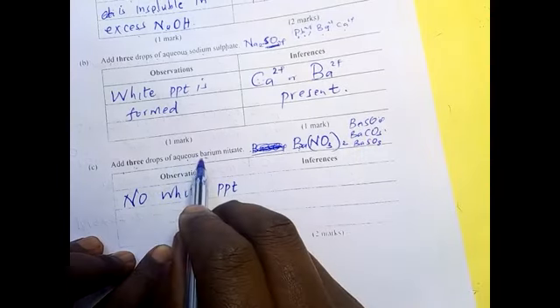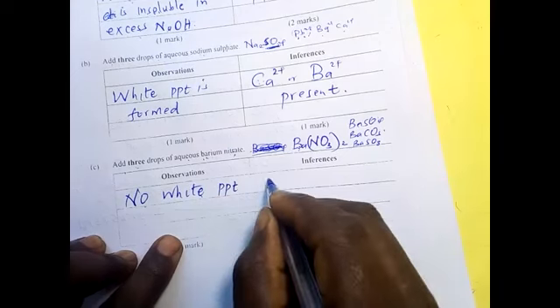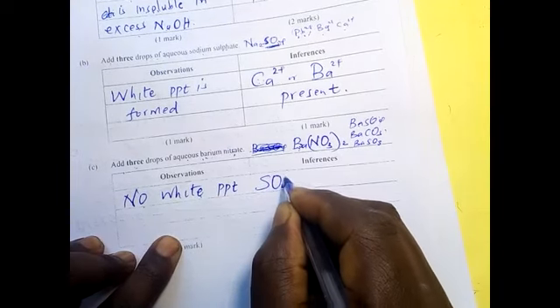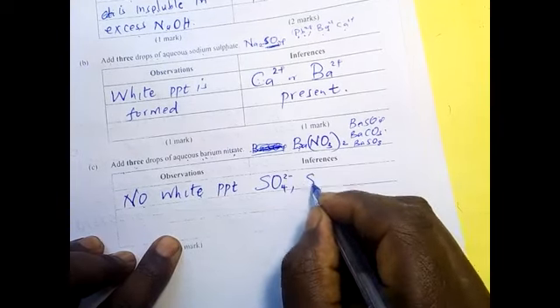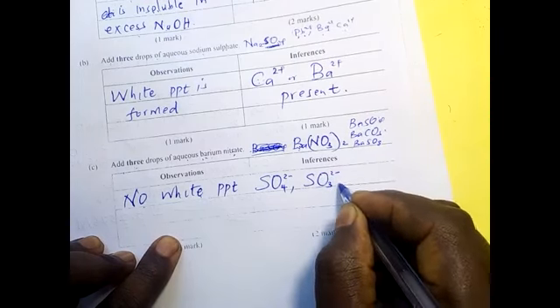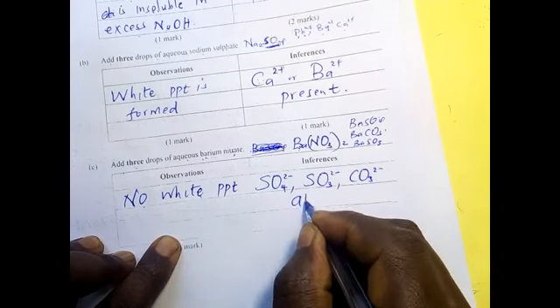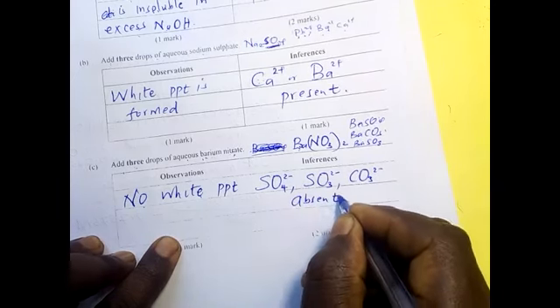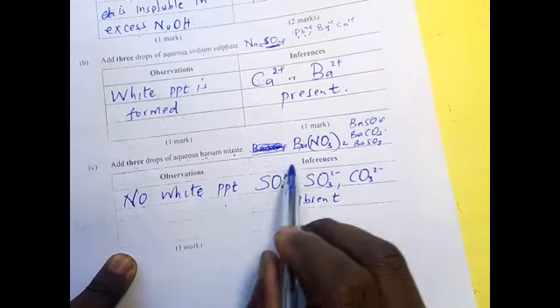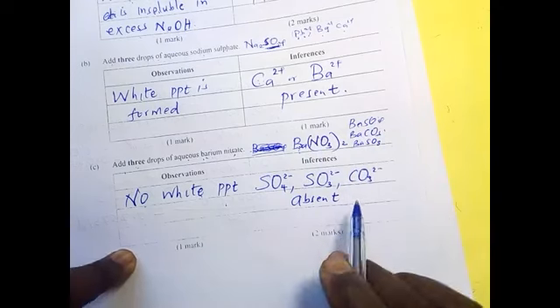But now, since there is no white precipitate, it means the sulfate, the sulfite, and the carbonate are absent. They are not there. Otherwise, if they were there, barium would form a white precipitate with them.